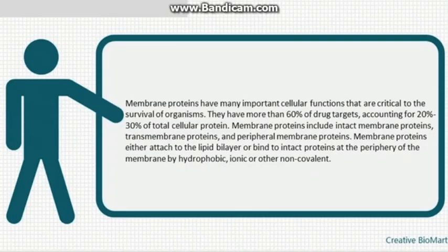Membrane proteins have many important cellular functions that are critical to the survival of organisms. They account for more than 60% of drug targets, and make up 20%–30% of total cellular protein.